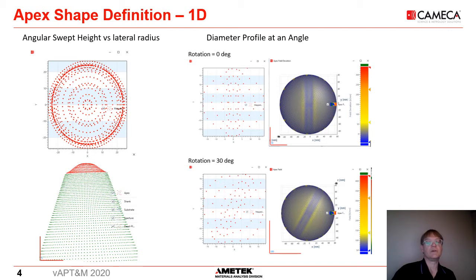On the left, we show an apex that has been specified by a simple radial profile. It is assumed to be azimuthally symmetric, and the profile shape is just swept around the apex center. The top image on the left shows how trajectories from uniformly spaced launch sites on the apex map to the detector. You can see that the concave shape we've imposed on the apex results in a pattern of low and high density on the hit map.